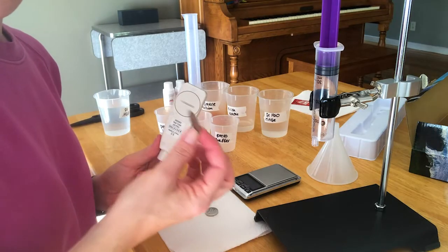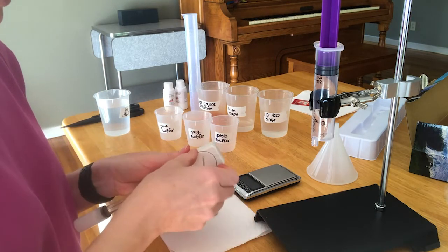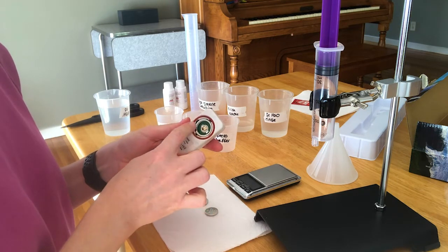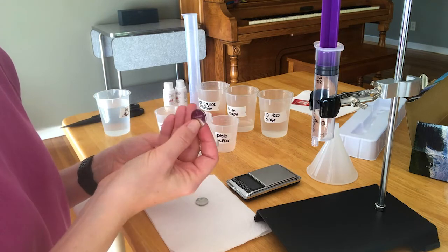You have to calibrate the pH meter before you start using it, so you're going to need a quarter to open the back. You just twist it to the right. You're going to see there's this little rubber seal, this o-ring — make sure that that doesn't fall out. So you have two batteries.